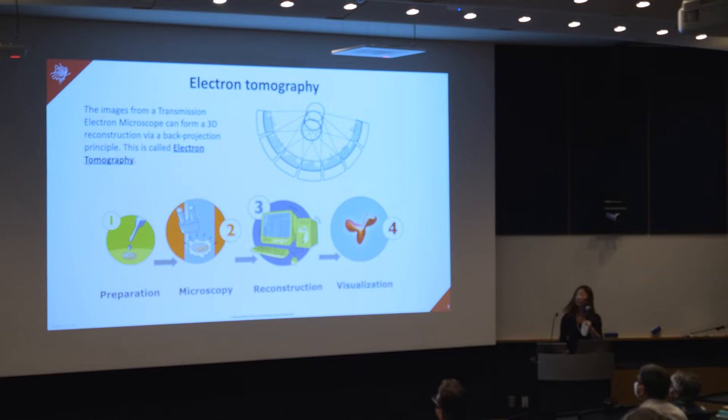And so Ove's expertise is electron tomography. It involves sample preparation. You have to use the microscopy. And at the end, you have to perform reconstruction to create this 3D visualization. And so Ove is going to go through all of these techniques in more detail.